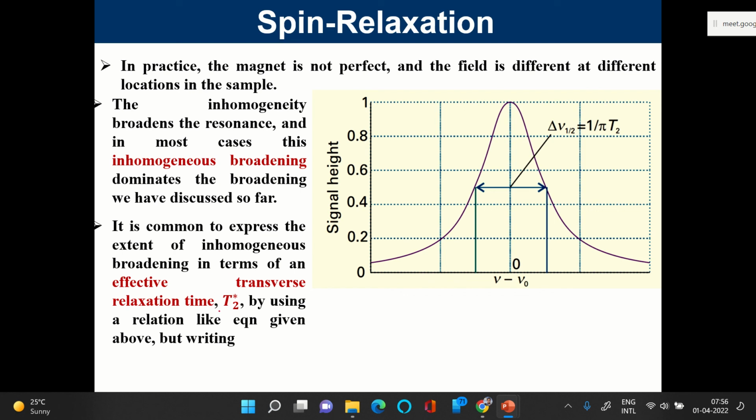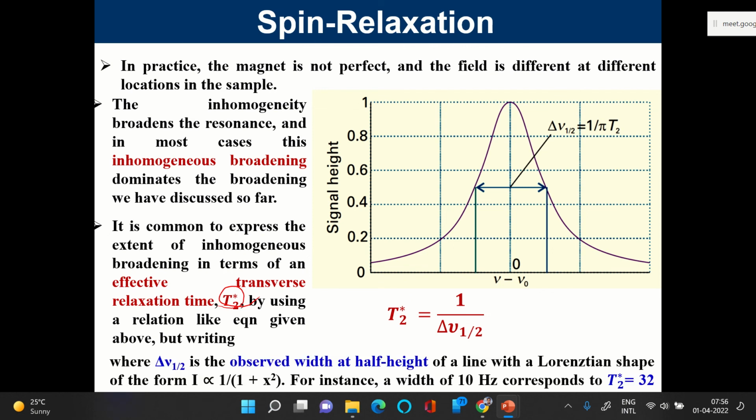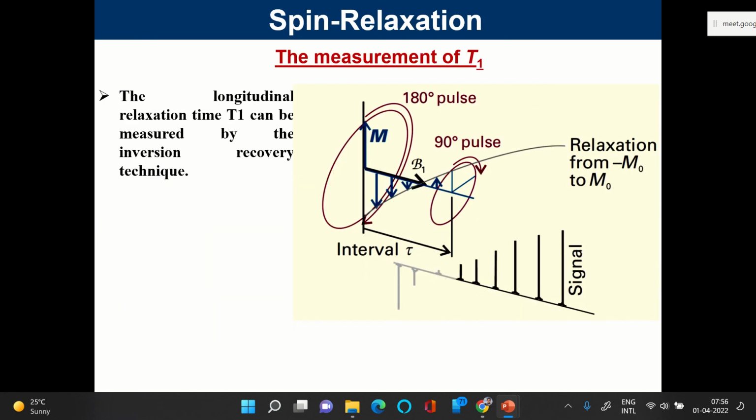That is why we now define this term as an effective transverse relaxation time. Directly calculating with the width also includes the width due to instrumental factors, which may have to be taken into account, and some of that can be taken care of by processing the signal and adjusting, including the Lorentzian fitting profile. That's something we can do.